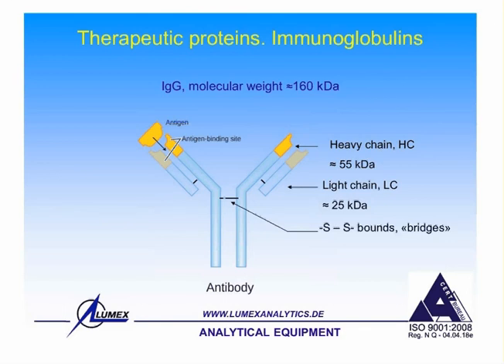So it's 5 stages. And if you want to save time, sometimes you avoid rinsing the capillary with sodium hydroxide every time between analyses, and you rinse the capillary only with a buffer, which in turn sometimes can be not sufficient. In order to be on the safe side, you need to wash it with sodium hydroxide always.